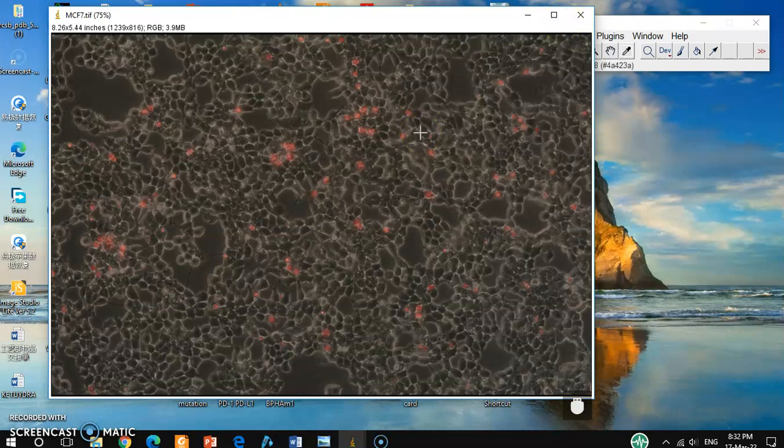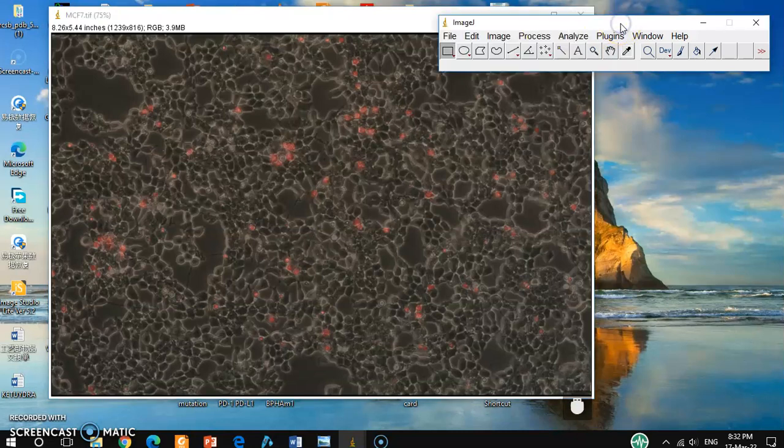So from here, how do we get bright field picture only?